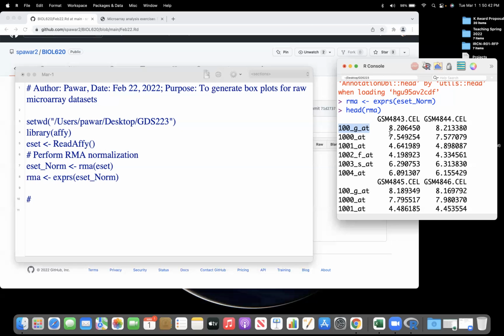So for all of you, the first 2 files are your treatment and the next 3 columns are control. Make sense? You're using 10 files? First 5 files treatment, next 5 files control. Just divide those columns. Assuming for me, I have just 5 files, so I'll assume the first 2 are treatment and the next 3 columns are my controls.